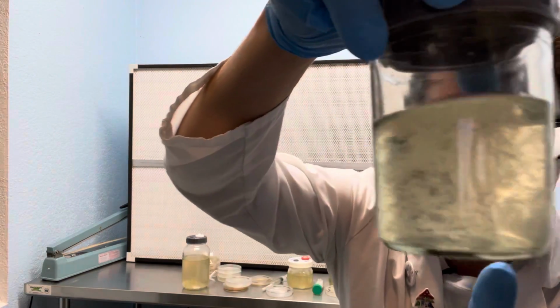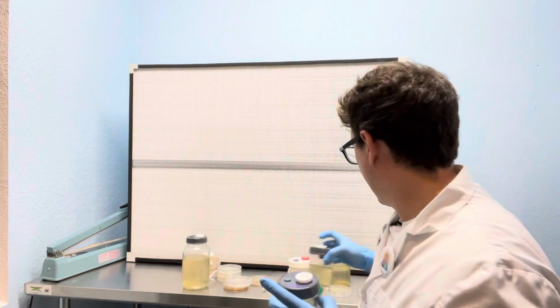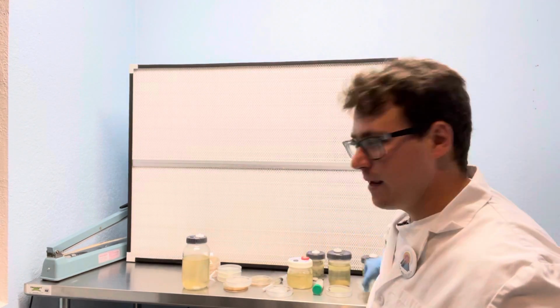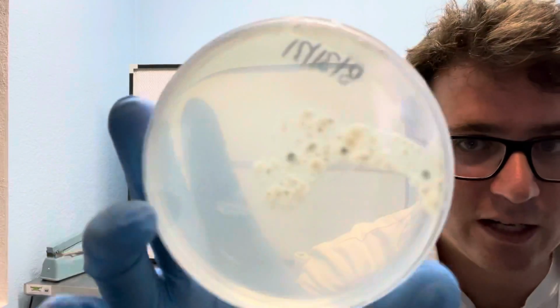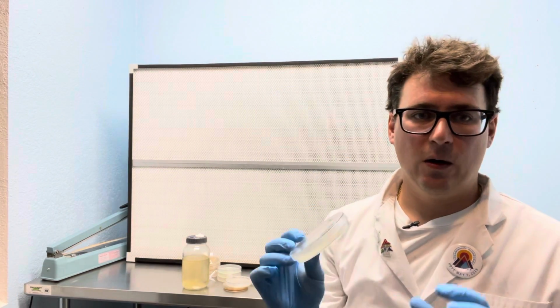There are a few spherical cultures in here, and I happen to know that there's some Trichoderma in that culture. So I was able to catch that contamination before introducing it to the next step, which actually saves me a lot of time and effort. And you can see this is a petri dish that I quality controlled from 2 days ago.